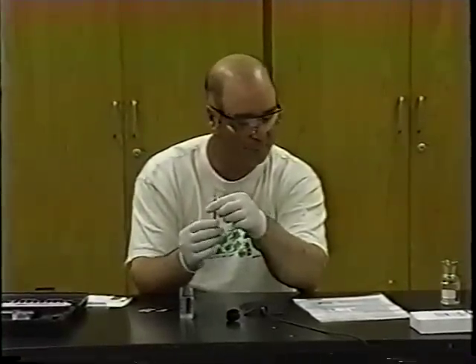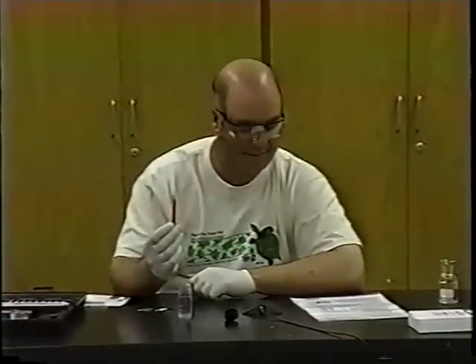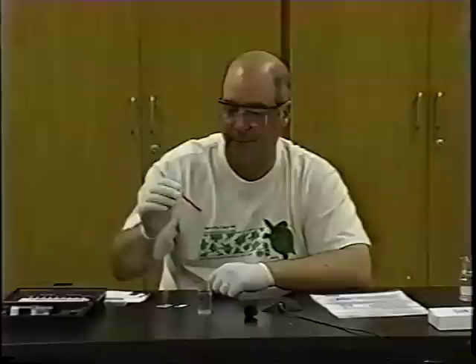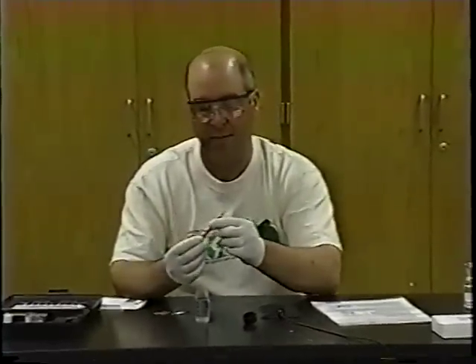Now we wipe all the liquid from the exterior and we wait 10 minutes exactly. That's all you have to do — the test is basically over. You wait 10 minutes and then you're going to make a comparison. One thing I can see is that there's a lot of nitrate already present in this sample, because we have a bright red color. We've agitated it using the air bubble to mix it, and that's all you have to do for this test.